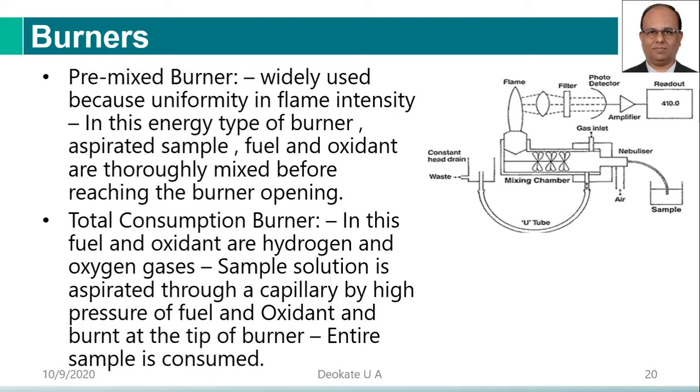In your kitchen, you may have Primus stoves. That Primus is nothing but the premix burner. They also utilize premix chambers where the fuel gets mixed with the air, and then it is converted to gases and comes out. So either we have a premix burner system, or we have the premix lamps, that is Primus lamps, which are used in the household system. They have a premixing chamber.